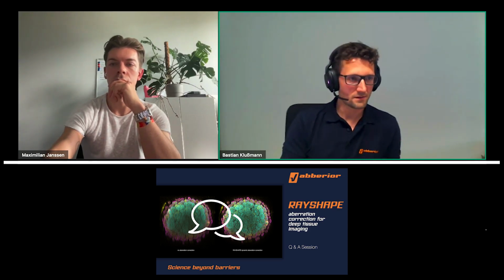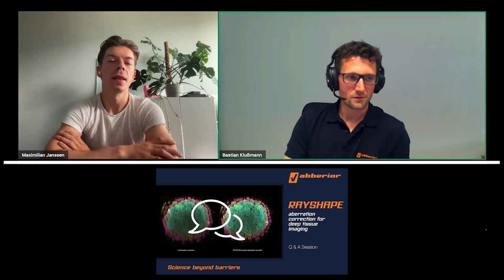Do you have any comments on that, Max? How do you do that?